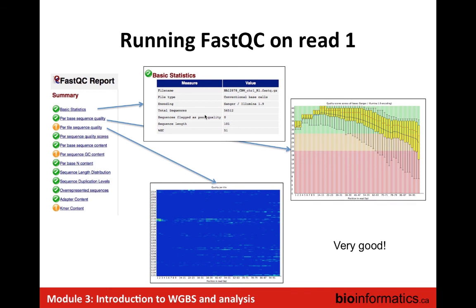So you can also run tools like FastQC that you saw yesterday. And actually, if we have enough time, maybe that's something that we'll be able to do at the end. We should be doing it at the beginning, but I wanted to make sure we'd have enough time to cover other things that you hadn't seen. But if we have extra time, that's one of the things that we could add as well in the practical.